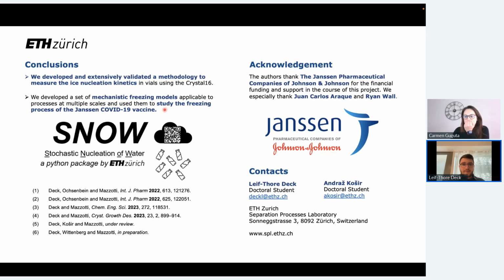And we open sourced this model, so every one of you can just download it. And I can really recommend to look into it if you work in freezing. And here on the bottom, you see the relevant publications associated to it. All of it is open access, so you can have a look at it as well.